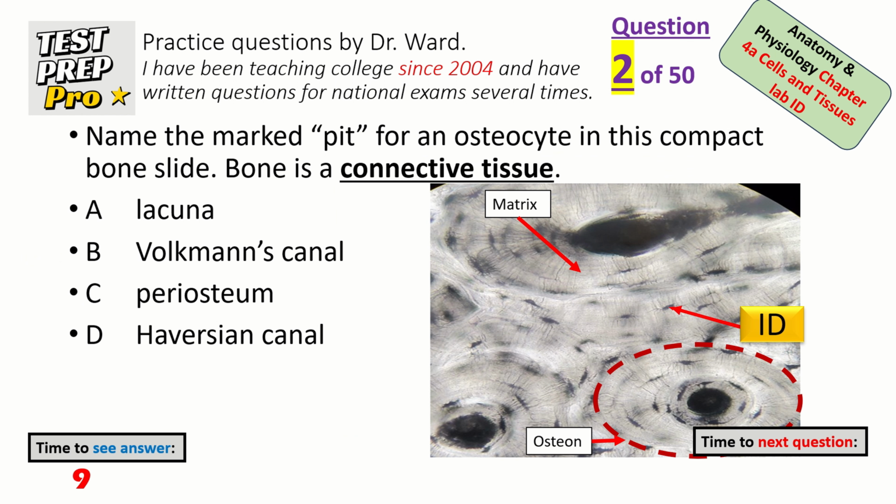Name the marked pit for an osteocyte in this compact bone slide. Bone is connective tissue. Lacuna.